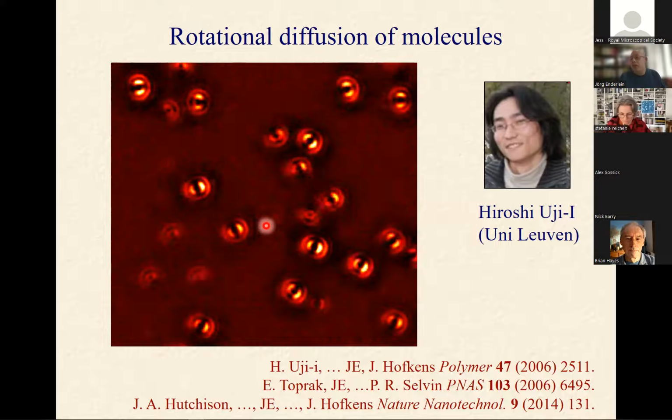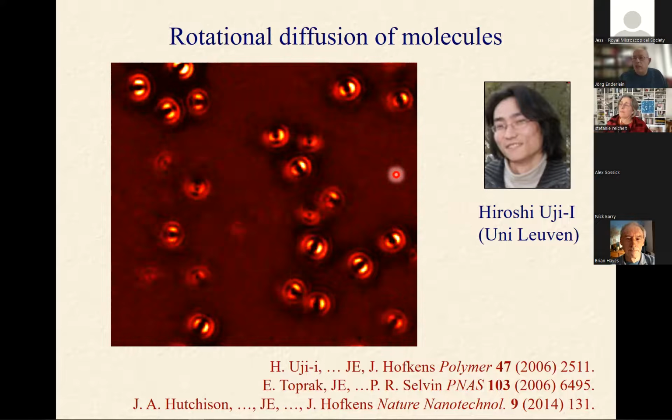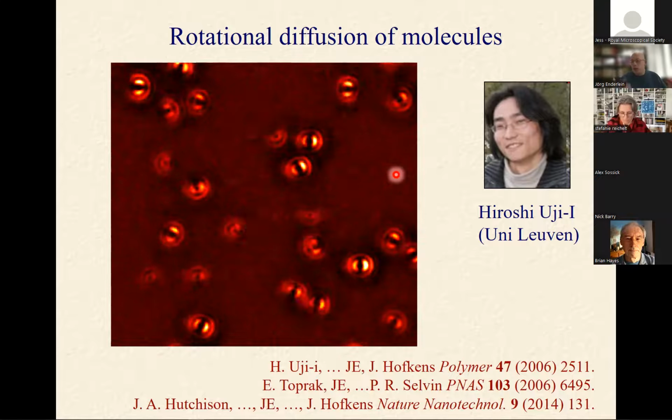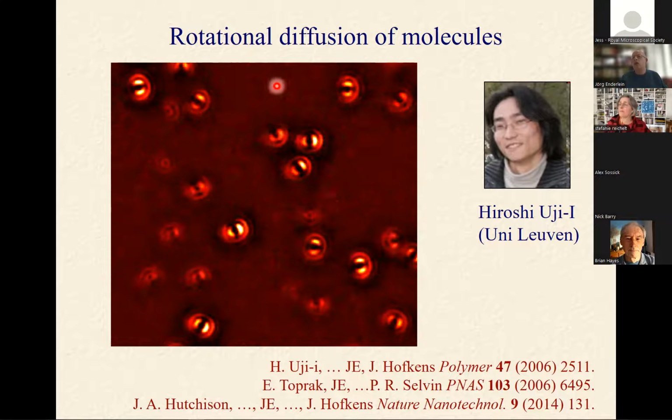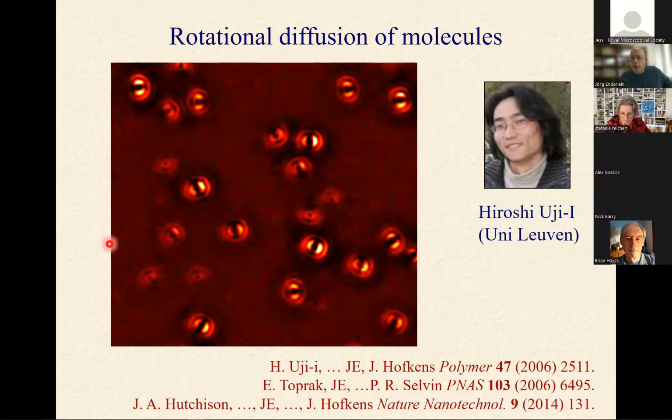We use this method in many different publications for reading out the rotational diffusion dynamics of single molecules, or for example, looking at bioproteins which are reorienting in space and then using fluorescence to watch their reorientation. So this is not the main point in my talk today.